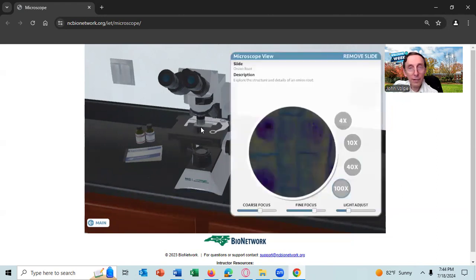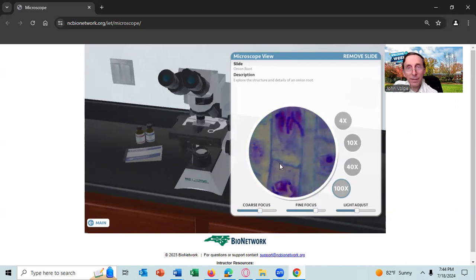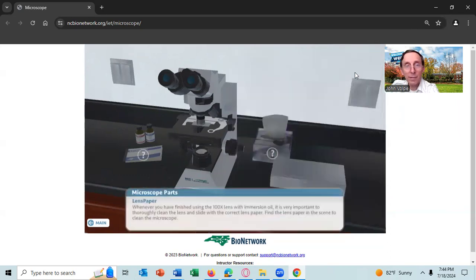So you put in a drop of oil, and now we need to find focus. Increase the light a little. See if I can get on the chromosomes. I can't get on the chromosome with this one. Well, there it is there. All right. Any questions about that? Then remove the slide because we're done for the moment.